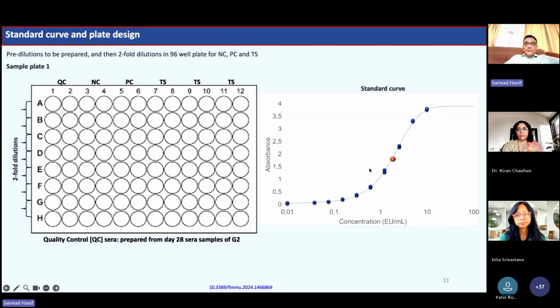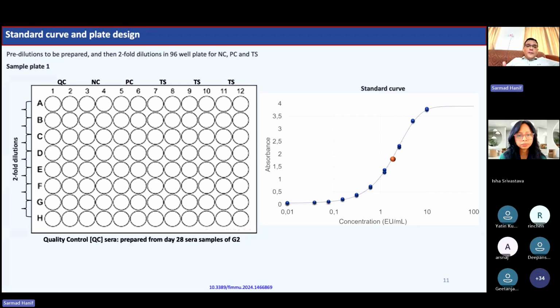So always remember, for ELISAs and biological assays, sometimes called bioassays, we have the sigmoidal S-shaped curve, and we don't estimate the lower part or the uppermost part, but the part in between.